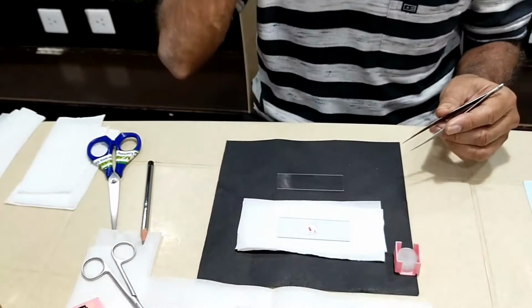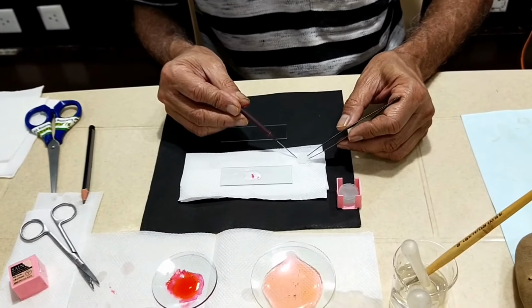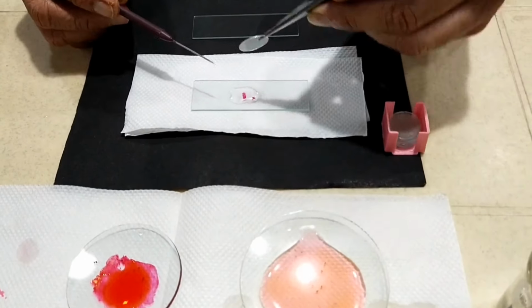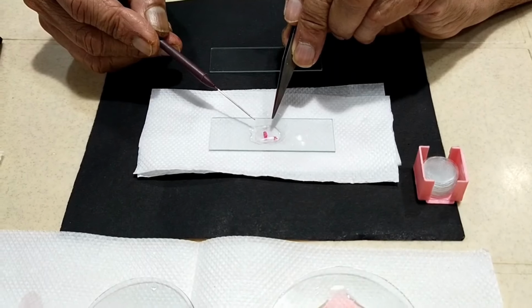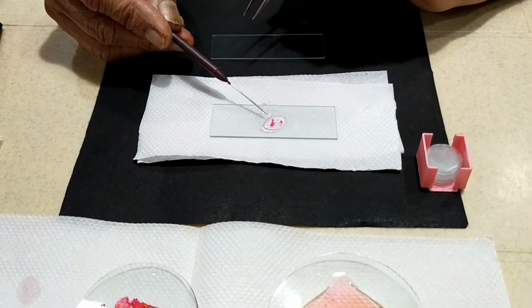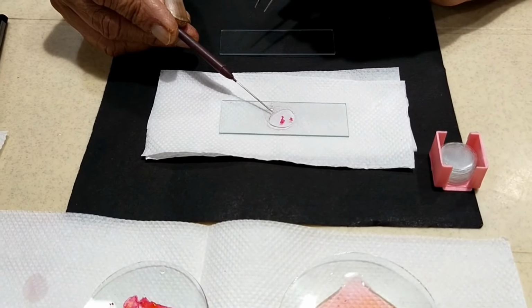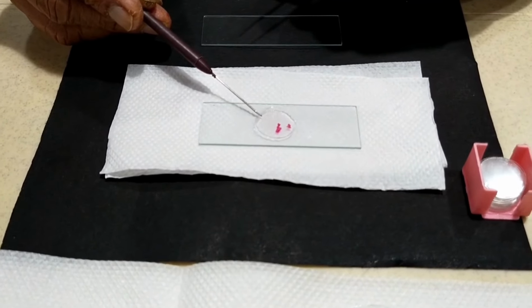Now for that, it is good to support the cover glass with the help of a simple needle, and then very slowly, see, very slowly I'm trying to drop the cover glass on the material taken.